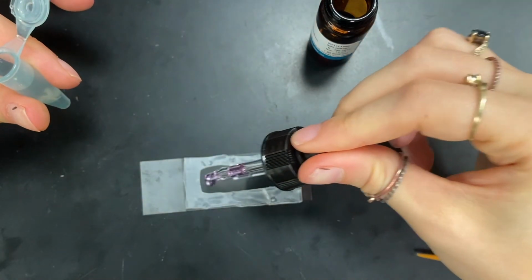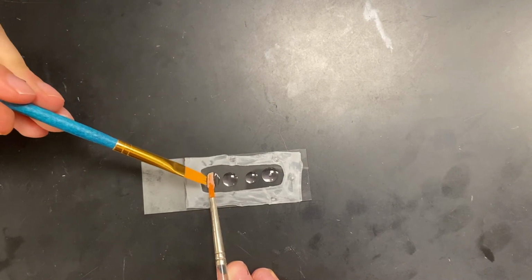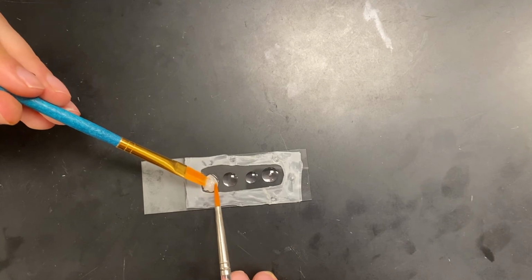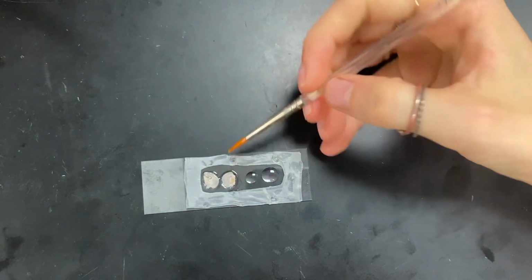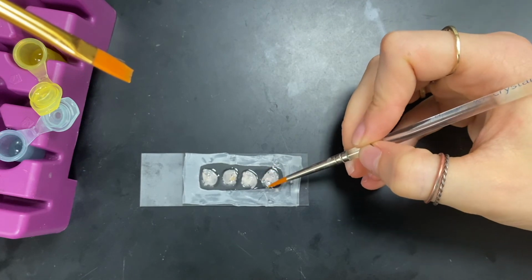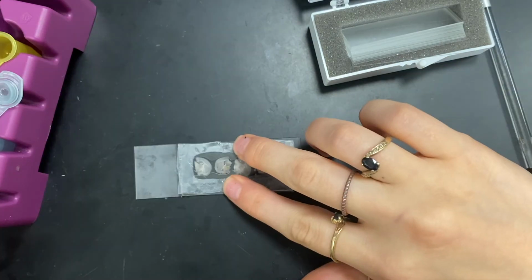But getting back to the slices at hand, I'm in the process of preparing the brains on a slide so they can be visualized on the microscope. They've already sat in the fridge overnight, and you'll notice that I'm not just doing 1 or 2 slices this time. This is because I feel pretty confident in the protocol and don't feel like any of these will be a waste or just practice. With 4 slices, I'm pretty confident that at least one of them should have the staining in the right spot with the right amount of dye. But I guess that's really up to the microscope to show me.